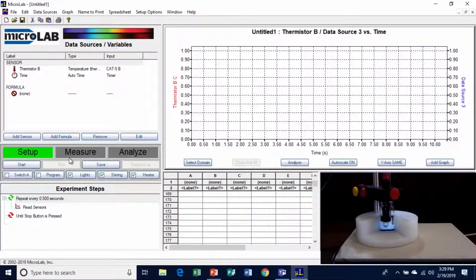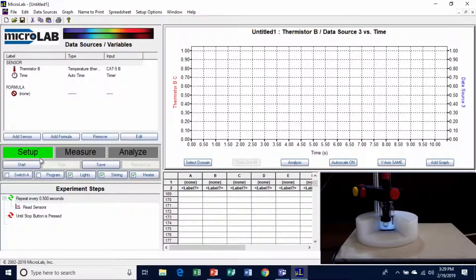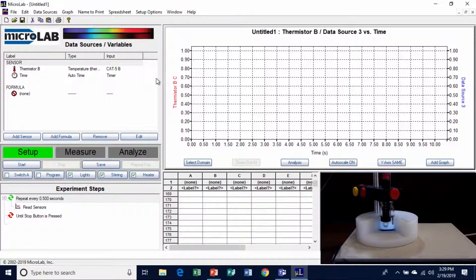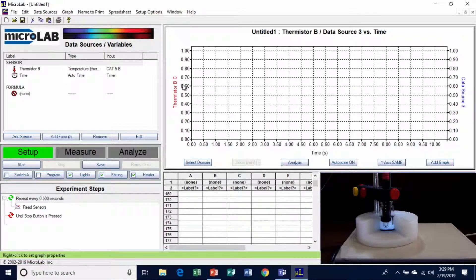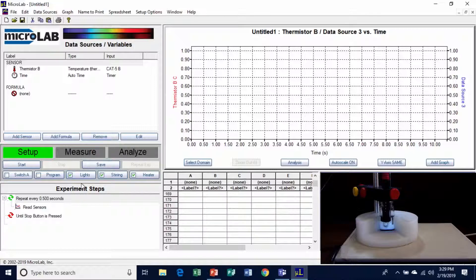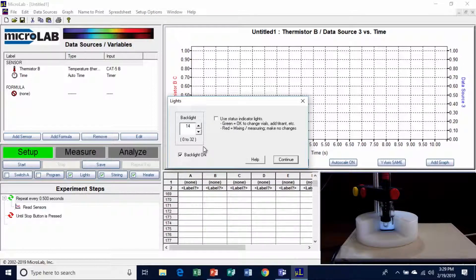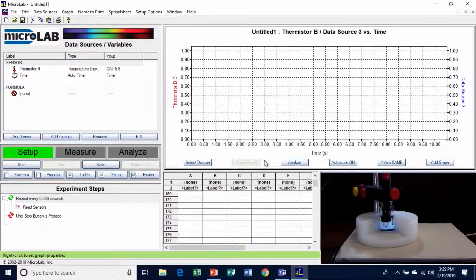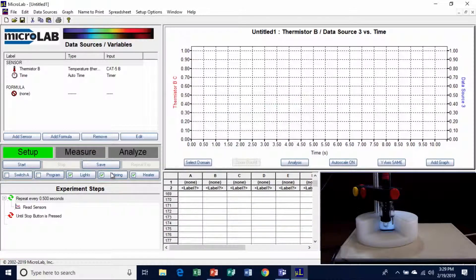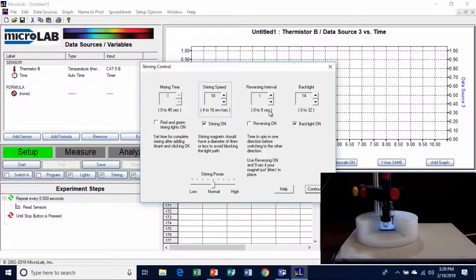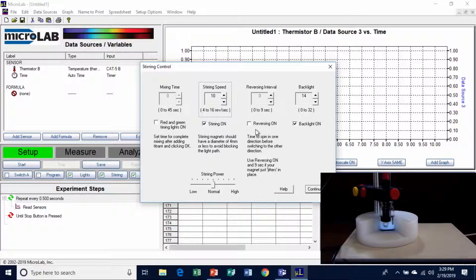Okay, we're going to set this up. I have set the thermistor up. I have time on the x-axis, thermistor B on the y-axis. I'm going to just check the lighting, the stirring, and the heater. The lighting is running. The backlight is on. It's about 14 units. You can see it's slightly backlit. I'll close that. I'm going to turn the stirring on, and the stirring is going. We'll run at about 10 revolutions per second. And I'm not going to reverse this time because the presence of the heater in the middle of that is going to break a vortex. So that should be stirring at this point. We're going to clear that.